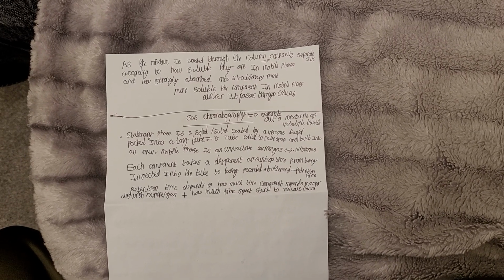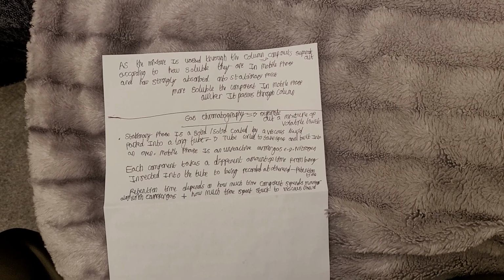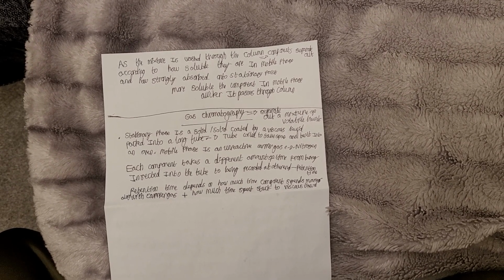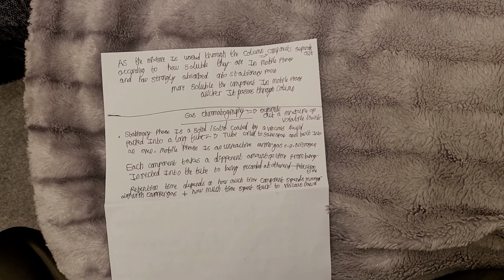Retention time depends on how much time the component spends moving along with the carrier gas, nitrogen, plus how much time is spent stuck to the viscous liquid. And gas chromatography is used to separate out a mixture of volatile liquids.